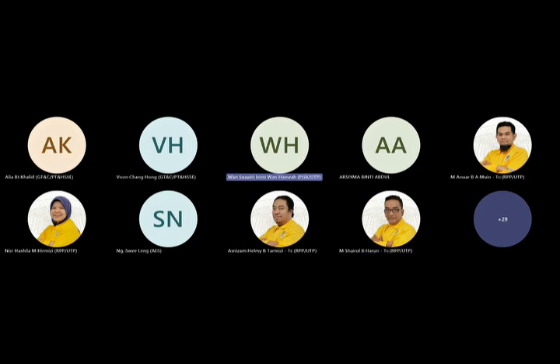Excuse me, I have one question, Miss Katrina, because you were talking about aurum, the gold, just now. If I have some sample coming from nature that has aurum in very low concentration, is it possible for us to detect it using ICP-OES?